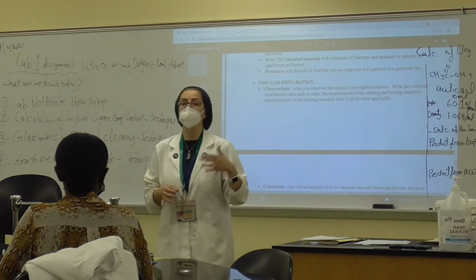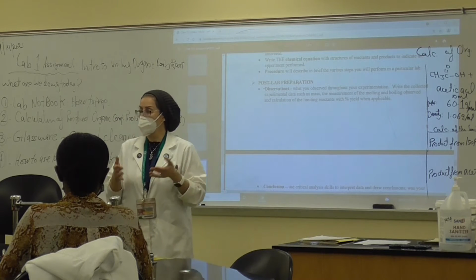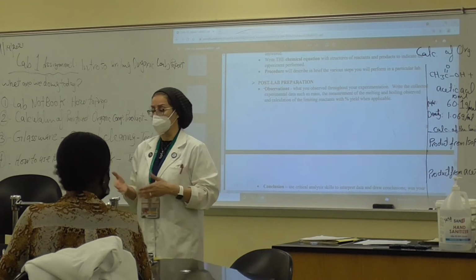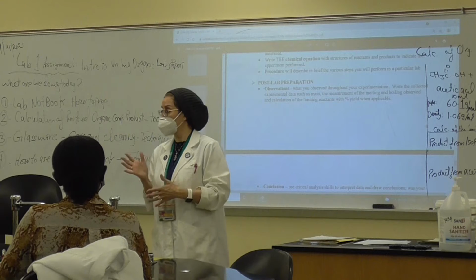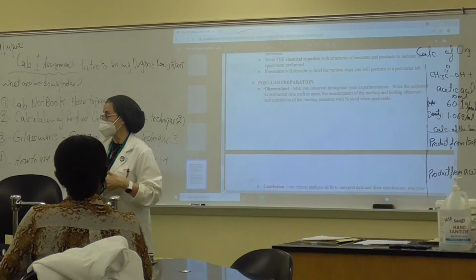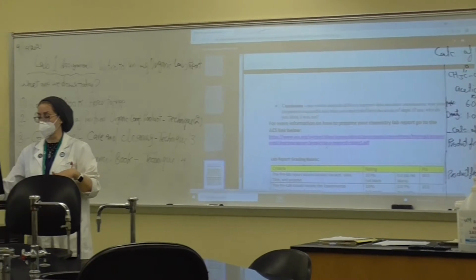You are going to justify the result. Why didn't I have something that my next bench or next group was able to get successfully? There must be something wrong that I did, or I did it but it was not working for me. So this is very important when you observe, and then you conclude your result. So this is then the conclusion as we are talking about.